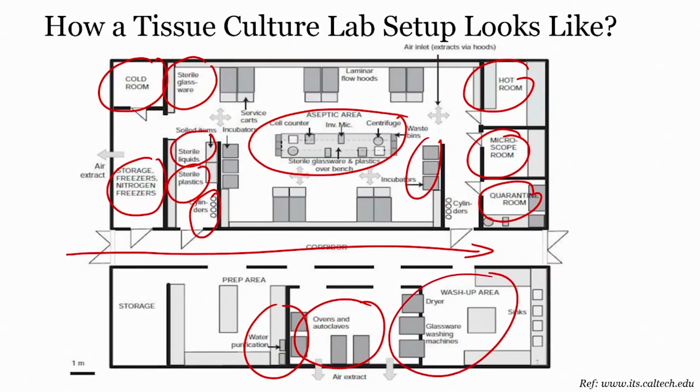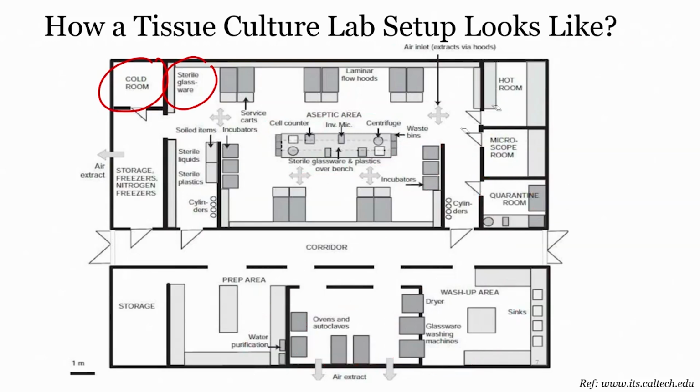This is typically how a setup looks. Now, we have taken an example from Caltech, but a similar kind of smaller facility we are also developing in my department, which is electronic systems engineering in IISc. It will not only have the cell culture lab, but also a micro engineering lab where you can fabricate the device, and within the same environment you can test the device in this kind of facility.